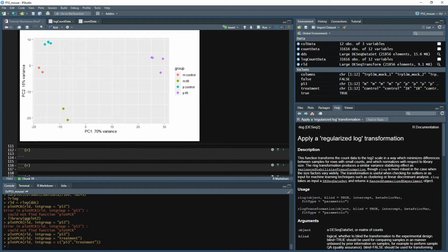Like I had mentioned before, now we can plot a heat map, and to do that we'll need three different functions, but two of them will be really helpful for the third.